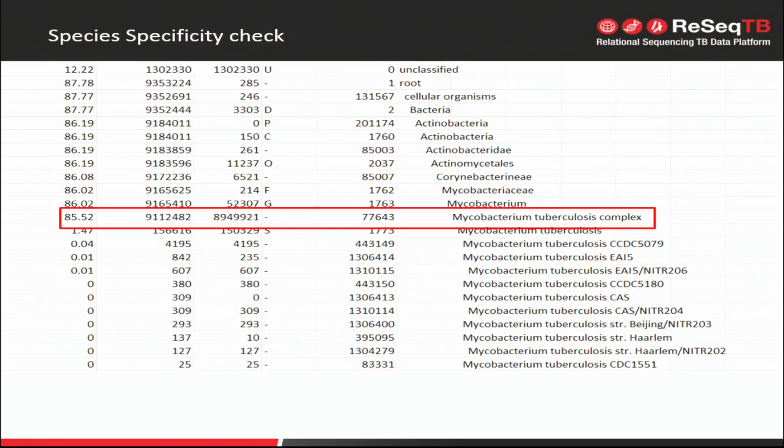What that means is basically 12% of your reads, the k-mers, were not found in this database, and this is a Kraken database, which is bacteria, archaea, and virus. So if it were human, it would be called unclassified, or if it was something that was never sequenced, unclassified. So the question is whether that is still vector contamination, human contamination, or fungal contamination, and we can BLAST those reads to see if we can identify what they are. And if we can do that, then we can basically rip out the reads that aren't mapping and keep moving forward.